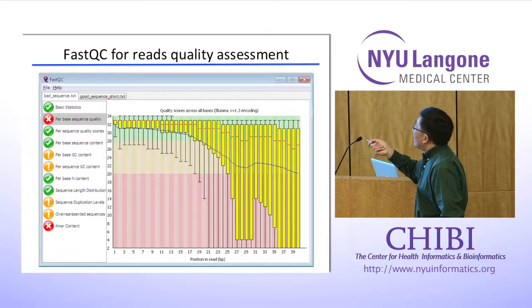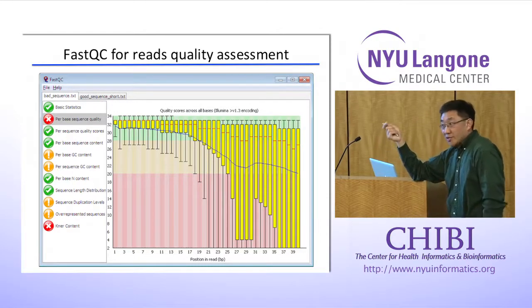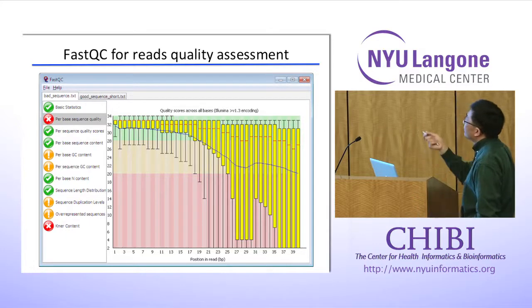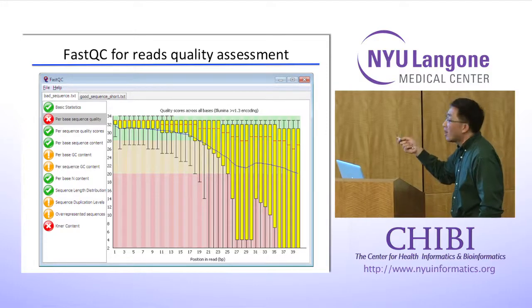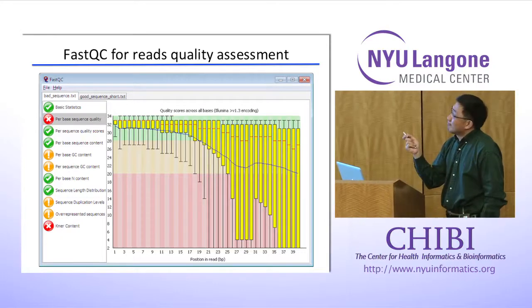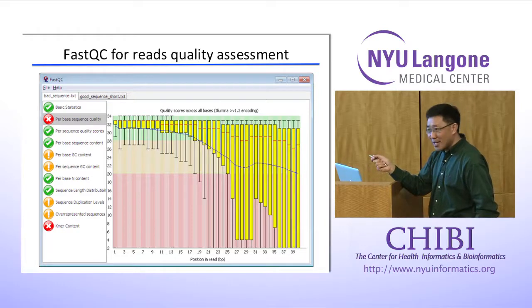For example, the letter H, if you translate it back to decimal, is 104. This 104 equals the Phred score plus 64, which means if you subtract 64, you will get 40. That 40 is the Phred score. In the old days, we had to code it ourselves, calculating the Phred score for each base and assessing all those reads.